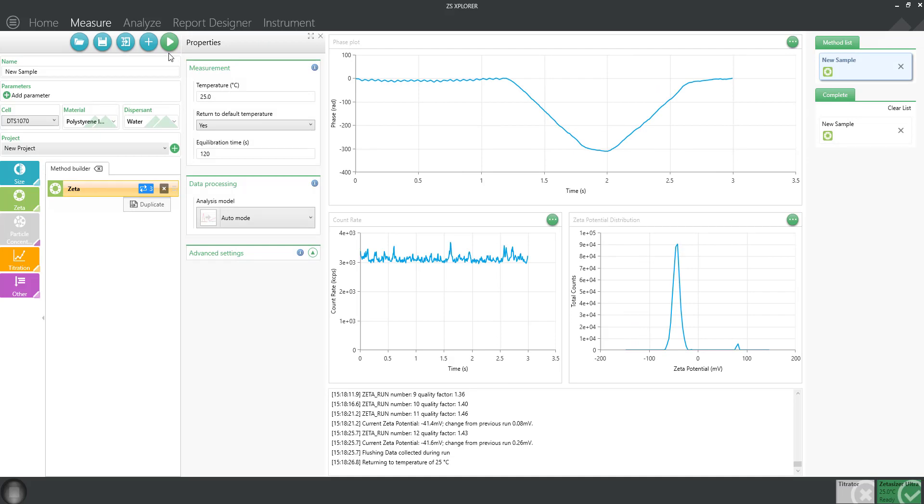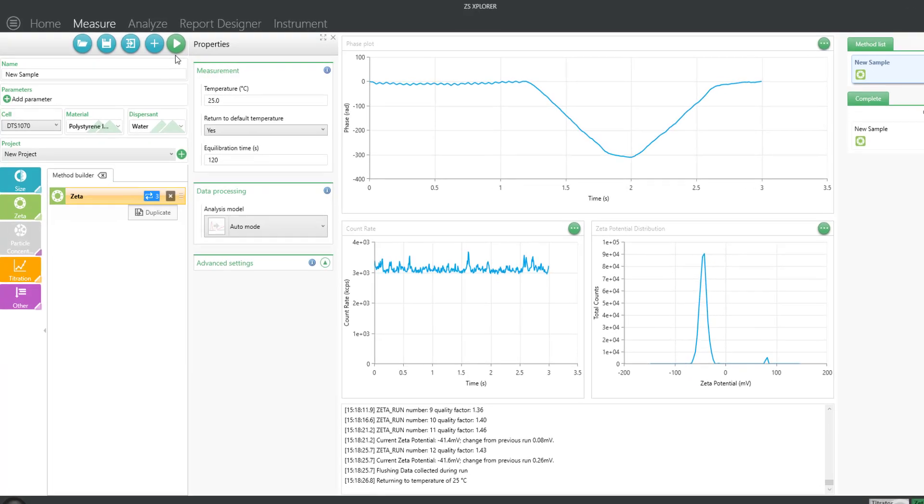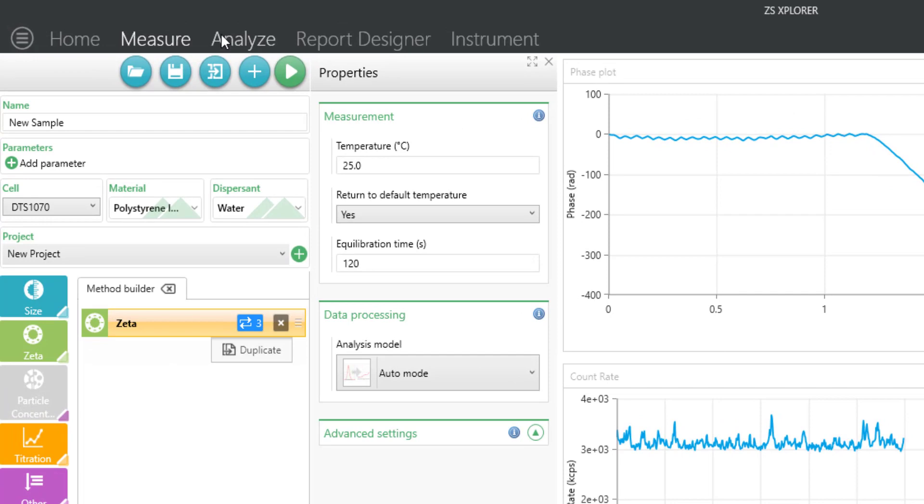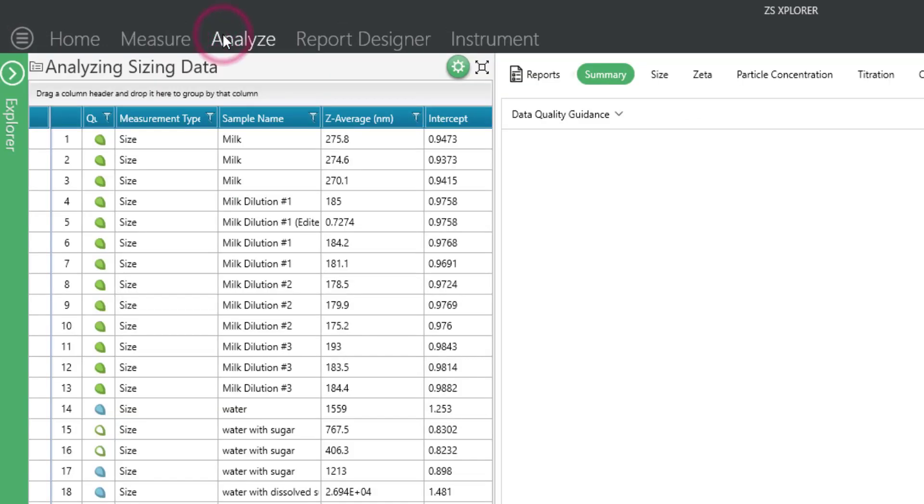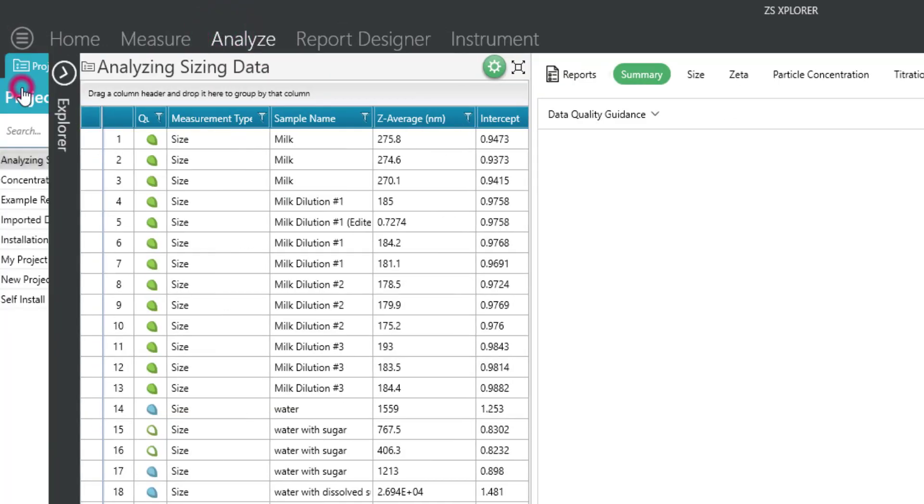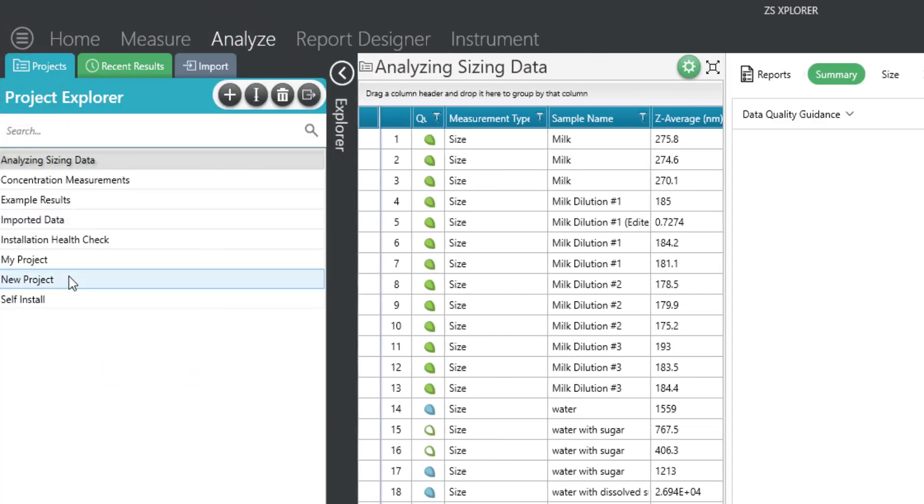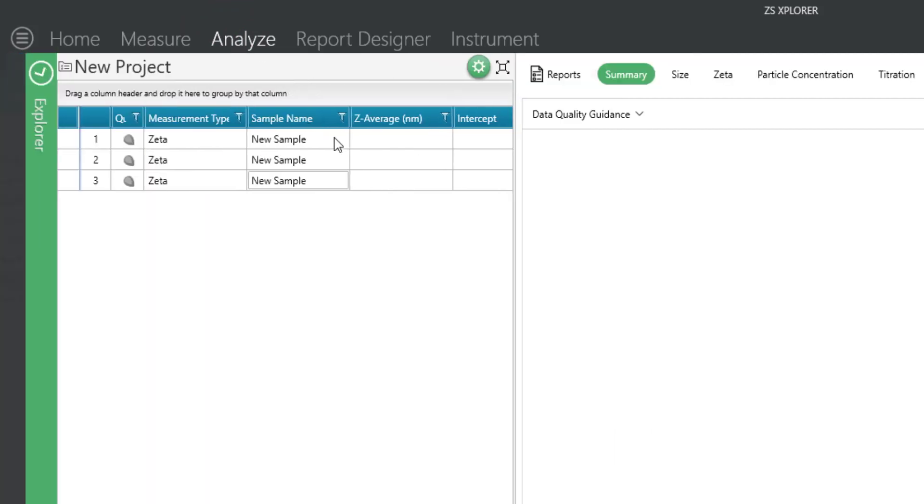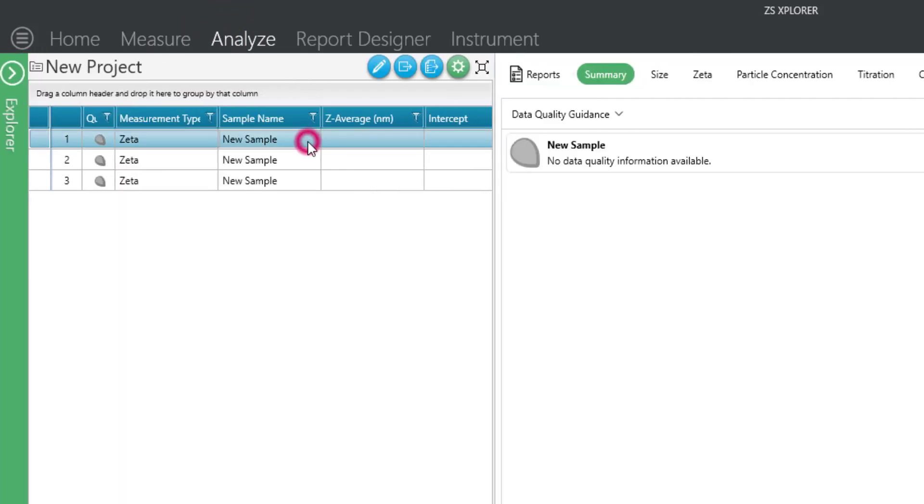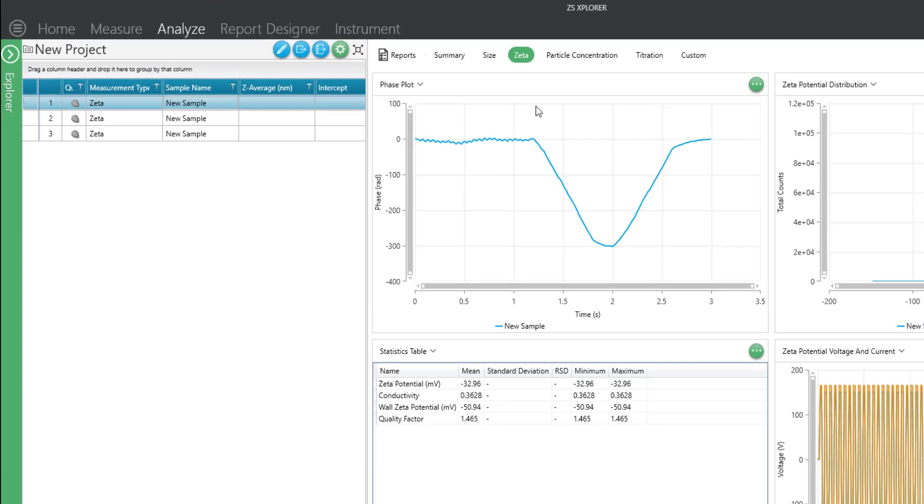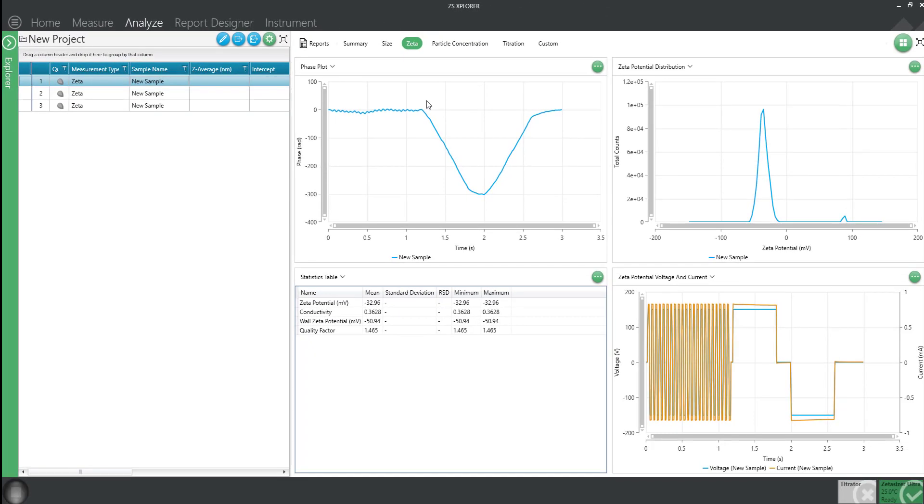To open your data, you can navigate to the Analyze tab. Locate your project from within the project explorer, select any data you would like to view, and use the Zeta workspace to view your results.